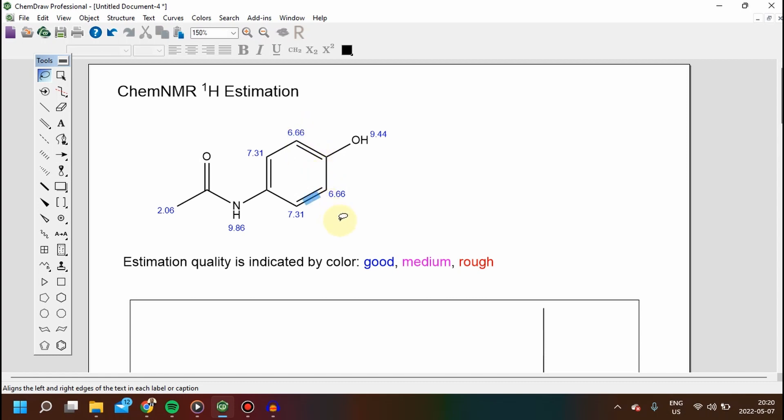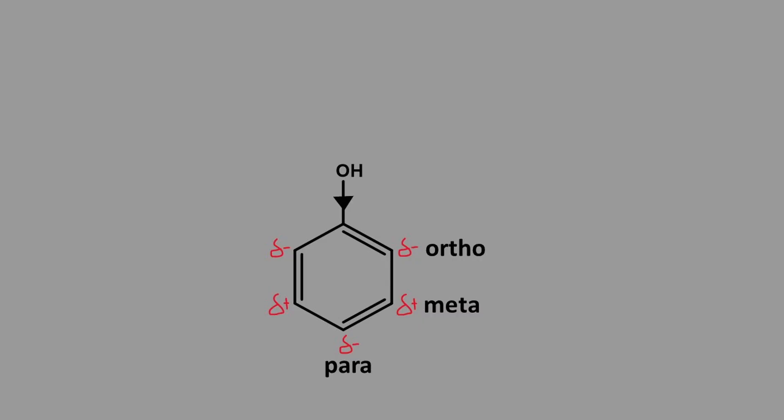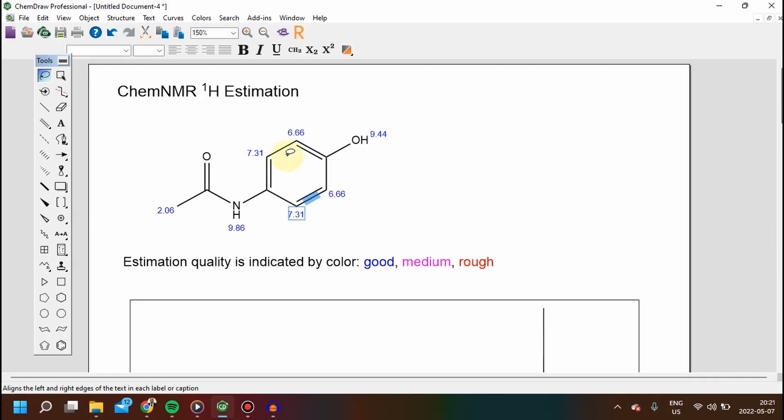In the ortho position, the protons resonate at 6.66, while in the meta position they resonate at 7.31. The OH on the ring is an ortho-para director, which means that the electron density at the meta position is very low. Because of the very low electron density at the meta position, the meta protons are relatively more deshielded compared to the ortho protons.